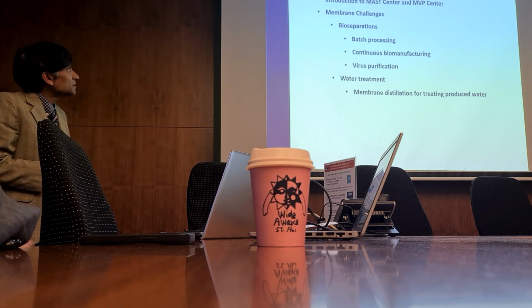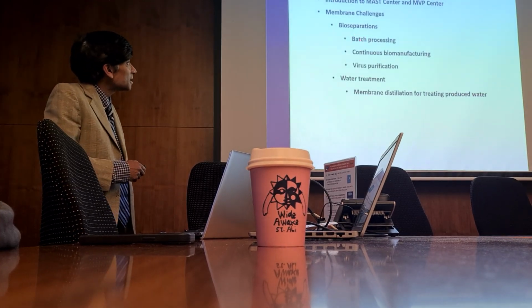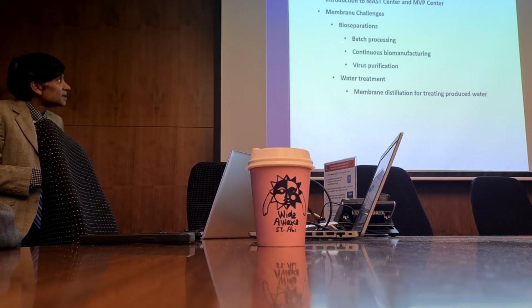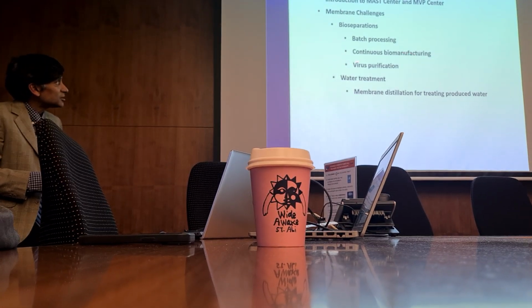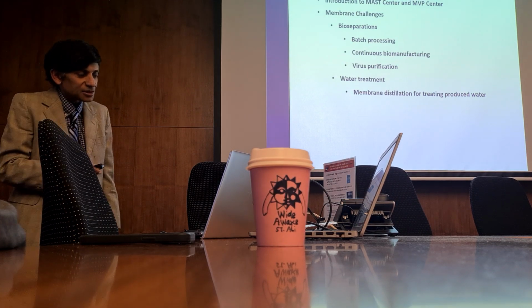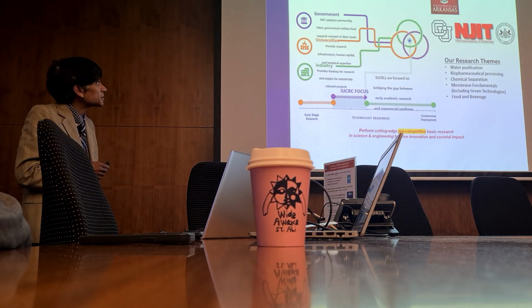So, this is what I was initially trying to do, talk about membrane challenges in bioseparations, and there are 3 different challenges I was going to talk about, but we can easily skip one of these. Today, mainly batch processing, continuous biomanufacturing, and virus purification. And I was going to talk to you a little bit about some of the work we do with membrane distillation for treating hydraulic fracturing produced water.